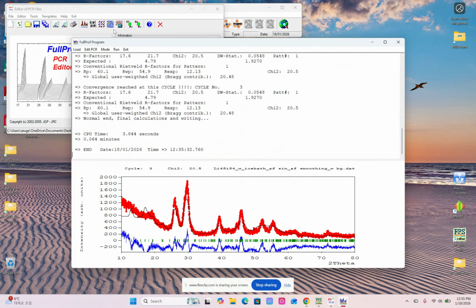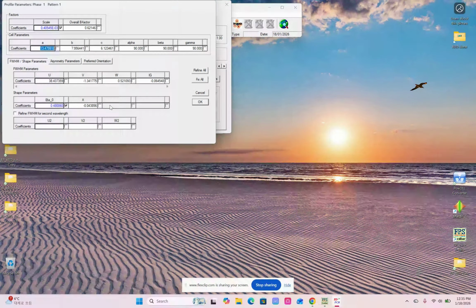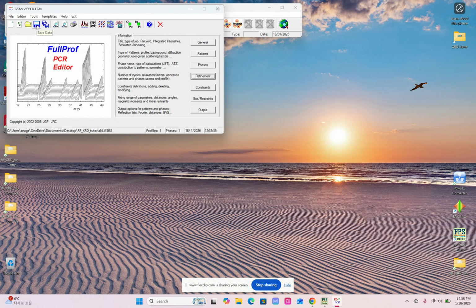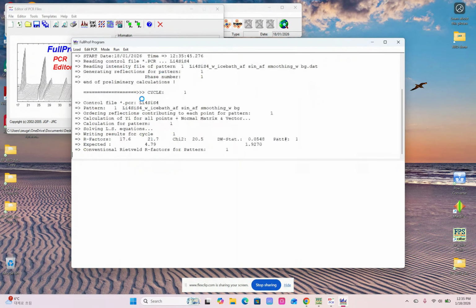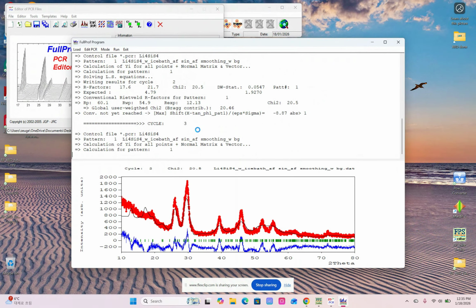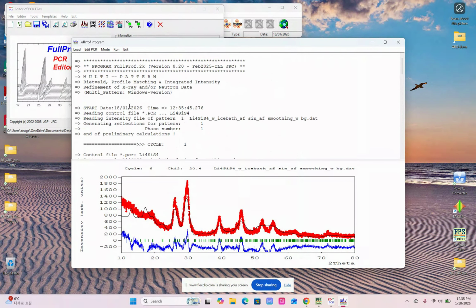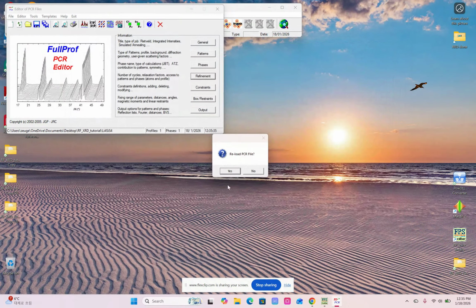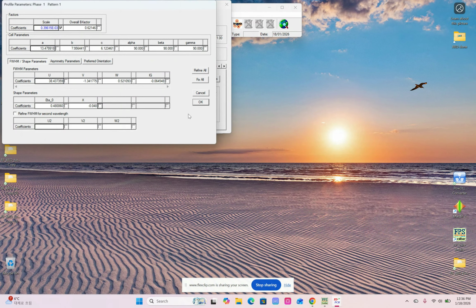And the last one. Good. No warnings, no warnings. Great. And let's exclude it again.